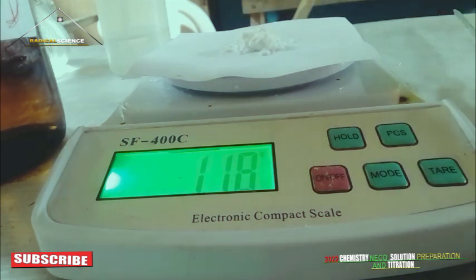Remember, what we are measuring is 4.20.